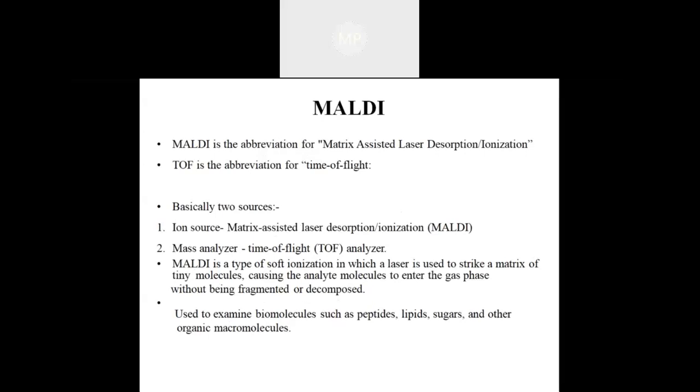Actually, MALDI and TOF are two different terms. The first is the MALDI, which is considered the ion source, and its abbreviation is matrix-assisted laser desorption ionization. And the second is the TOF, the time of flight, which is considered the mass analyzer.